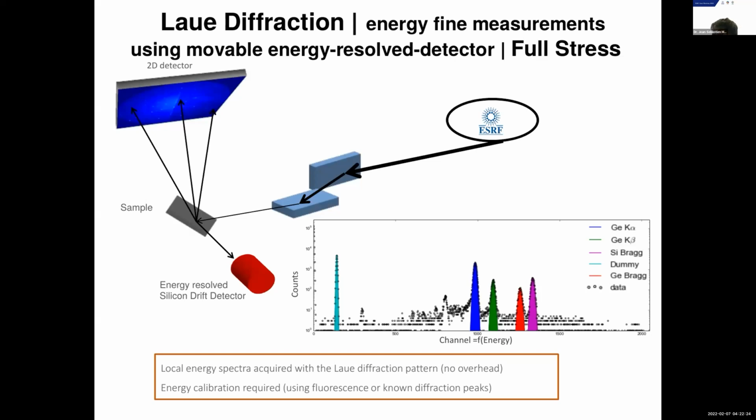So Sebastian, there are two questions in the chat which haven't been answered. The first question is, can this technique also be applied to low Z compounds, for example, organic compounds? So yes, due to the spectral band of our beamline, we are using 5 keV to 22 keV X-rays.